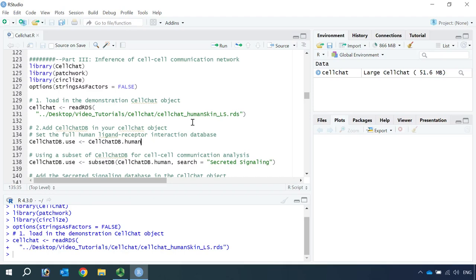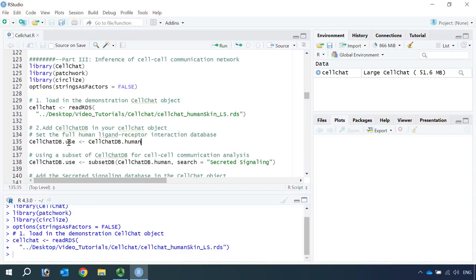Next we can set the CellChat database for our analysis. Because the dataset is a human skin single-cell RNA sequencing dataset, we need to use the human CellChat database. If you want to use the full database for your analysis, you can set the CellChatDB.human as CellChatDB.use.